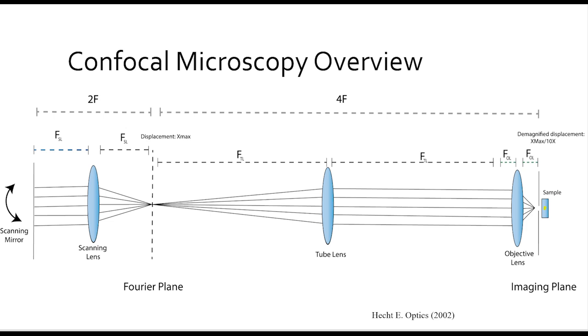So this improves resolution. Then this small focus point is scanned across the object, and each point is reconstituted into the image. So this requires a confocal pinhole and a scanning mirror. And each point that is scanned will be reconstructed to create the entire image.